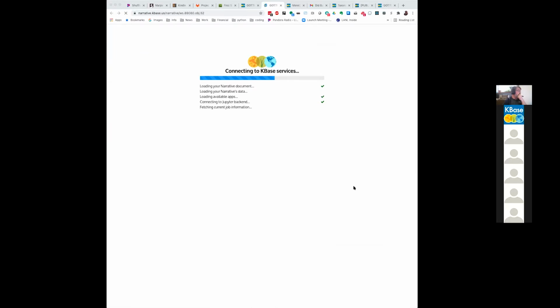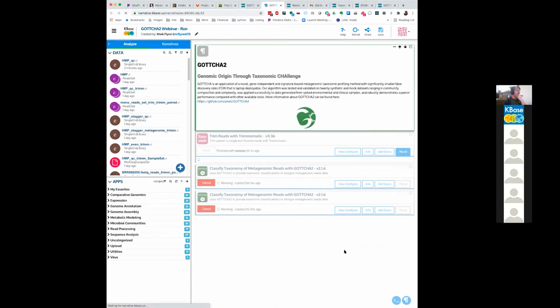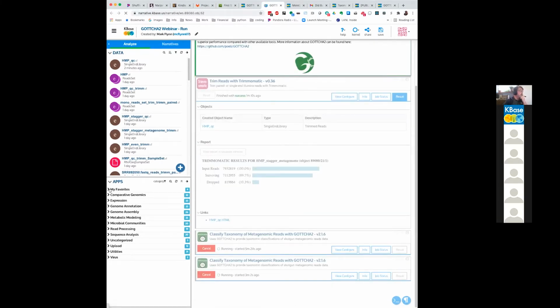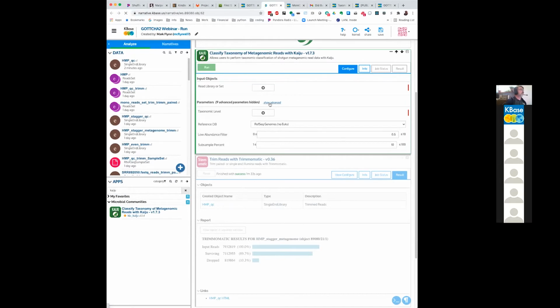There was a question about Kraken 2. All the analyses were done with default parameters. Okay, so let's try Kaiju again. You see I'm looking in my favorites, but if you search for Kaiju, they should be in microbial communities. All right, so show advanced.